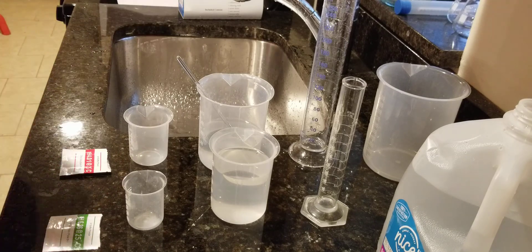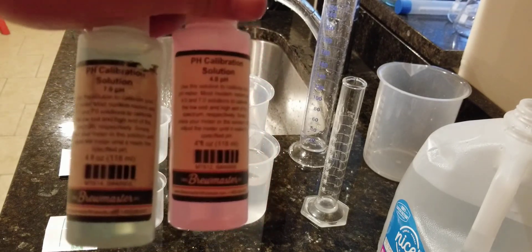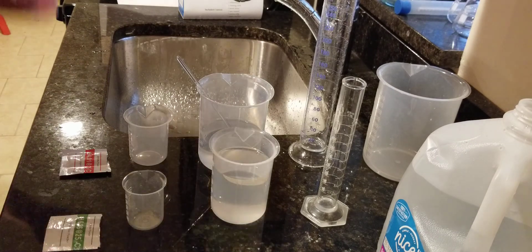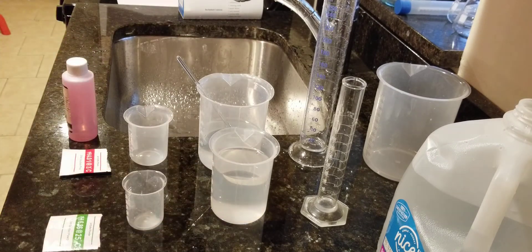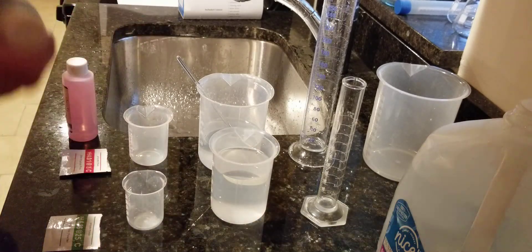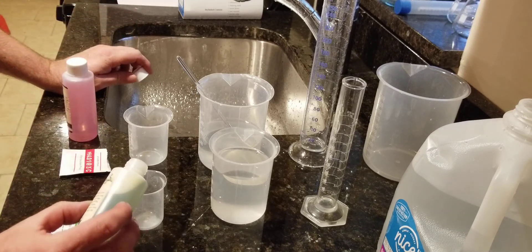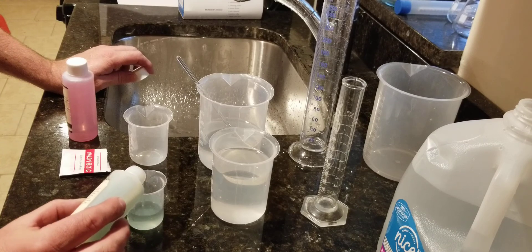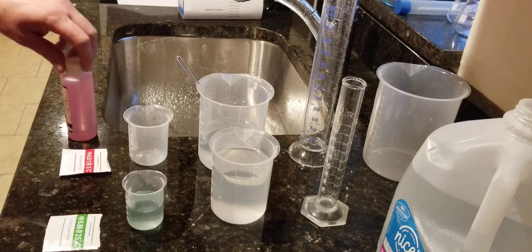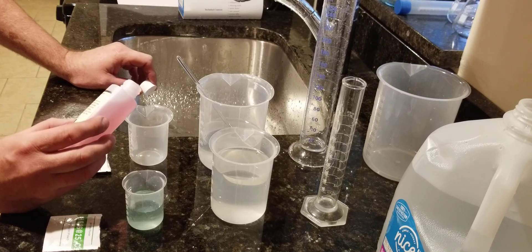pH calibration solution — you can see it's already mixed. The six looks pretty darn good. The nice part about this is you don't need a lot of it.